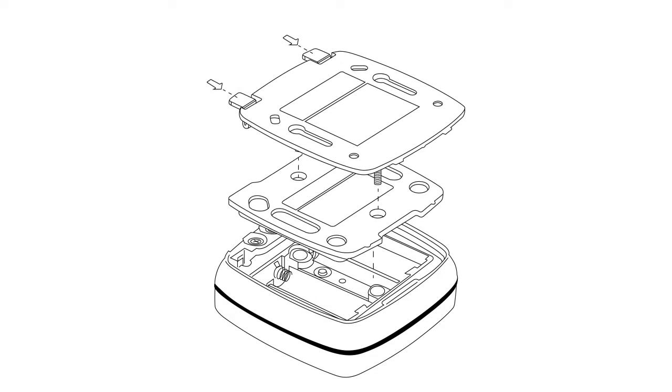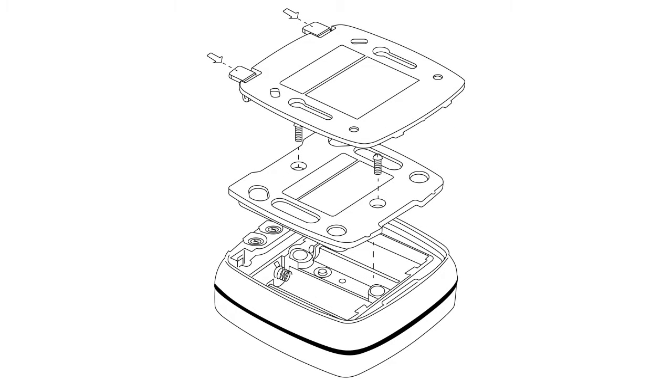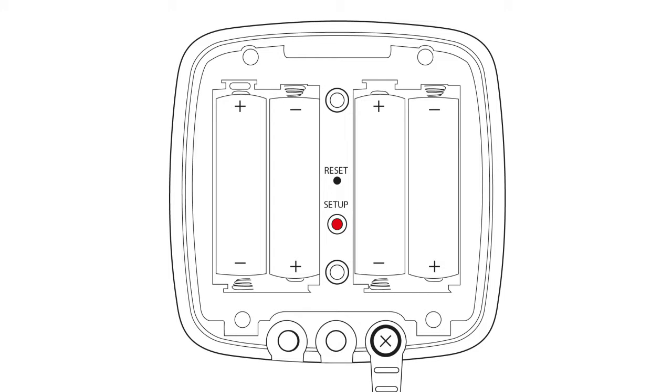Once you've attached your probe and inserted your batteries into the EL Mote, you are ready for setup. Do not replace the backing plate at this stage — you will need to access this area in setup.